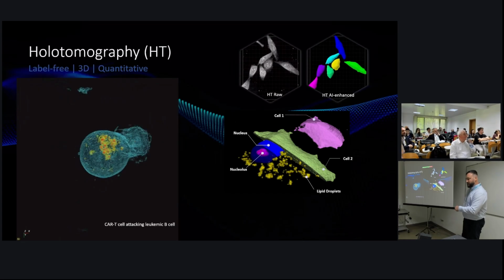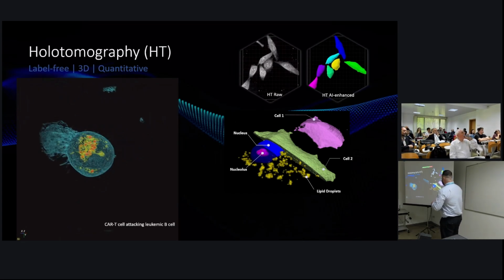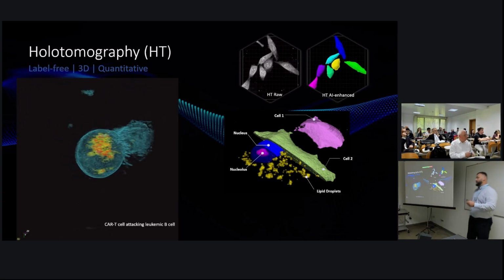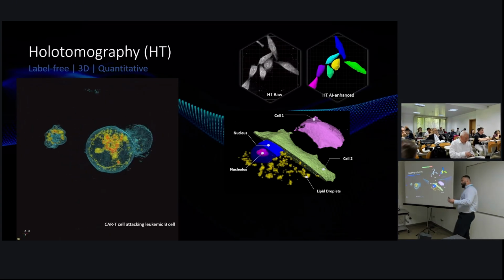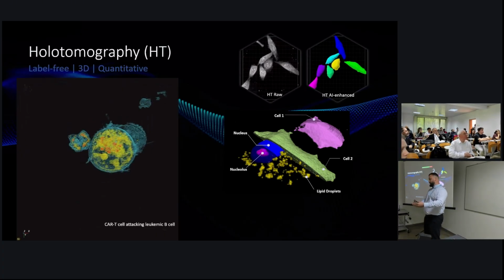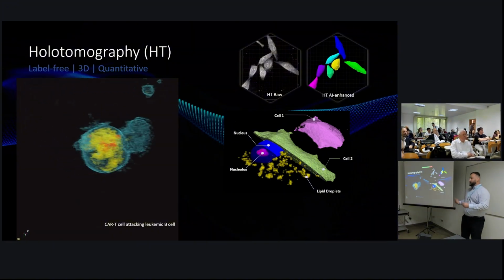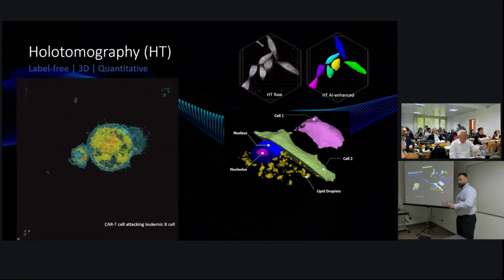And of course the pretty pictures, which I'll show you in a second. But in doing so, now you can quantify individual things. So you can segment in 3D the objects of interest. We're looking inside the cells. We're not looking at a population of cells. We're looking inside individual organelles of a cell due to the resolution and the measurements themselves.